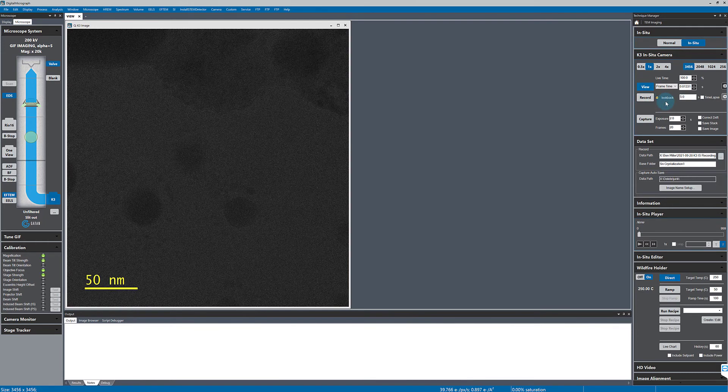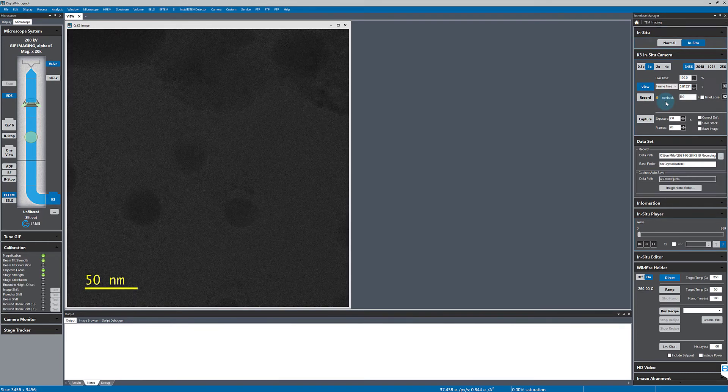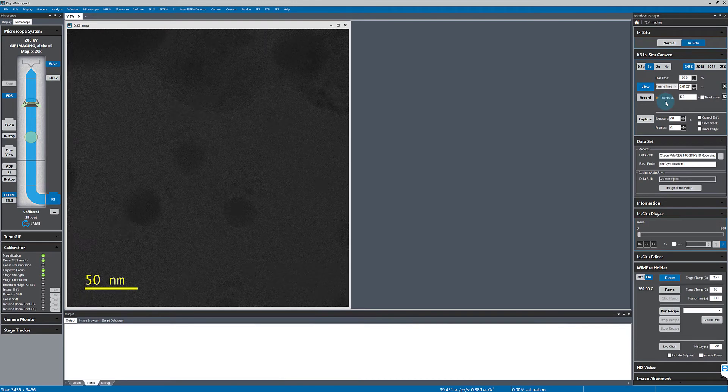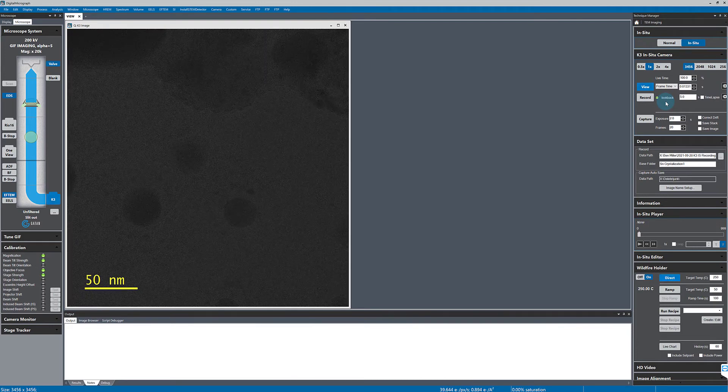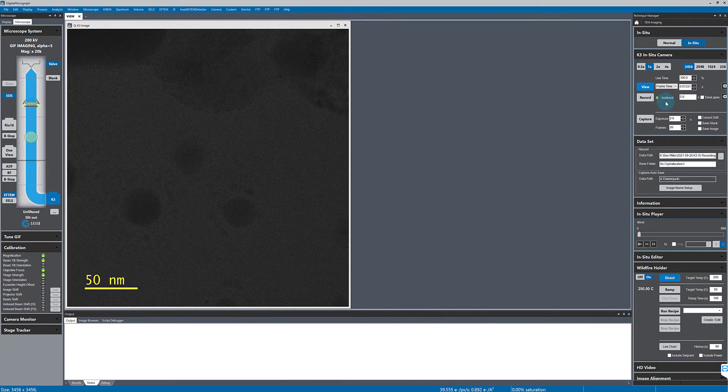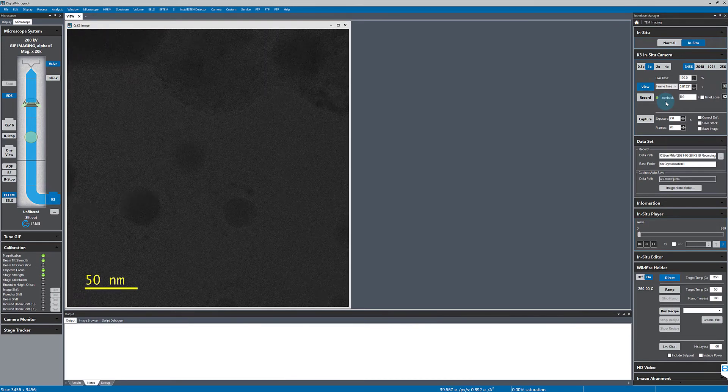Here we're looking at a tin nanoparticle sample, and now I'll turn on look back and set the buffer to keep five seconds of data.